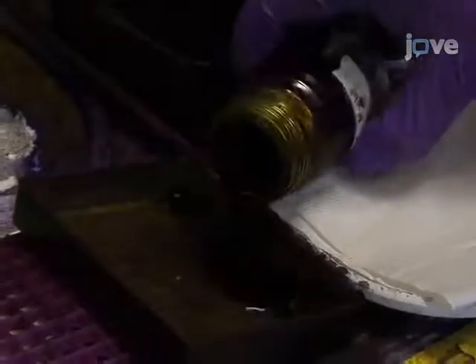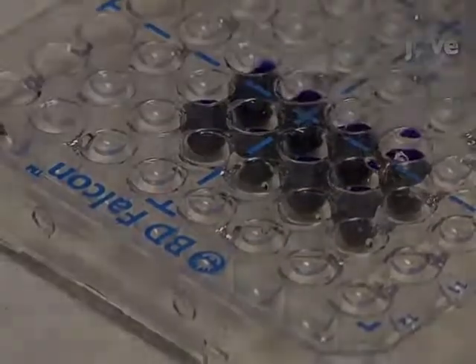Once the plate is clean, add 125 microliters per well of a 0.1% crystal violet solution to stain the cells.